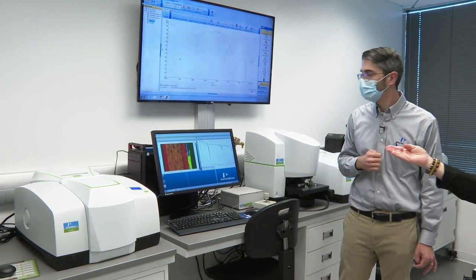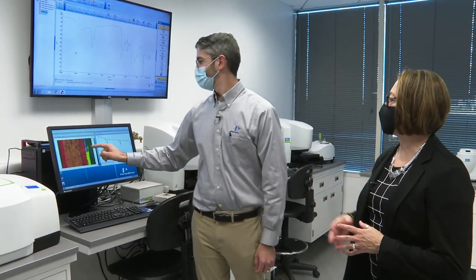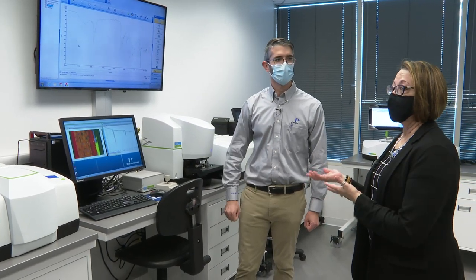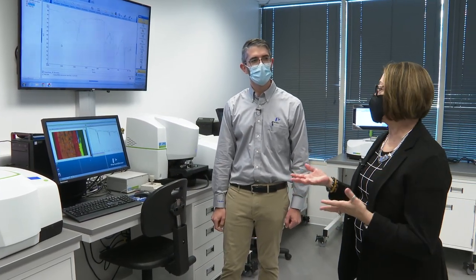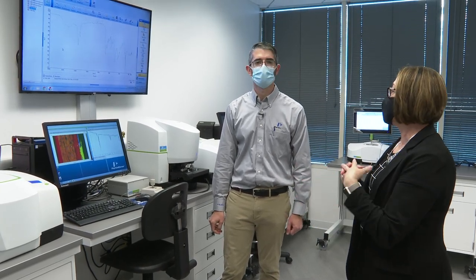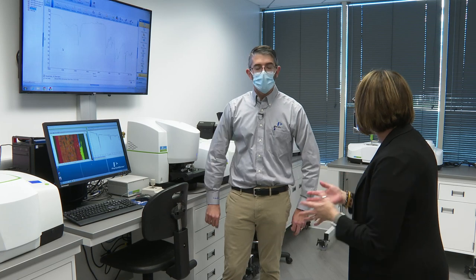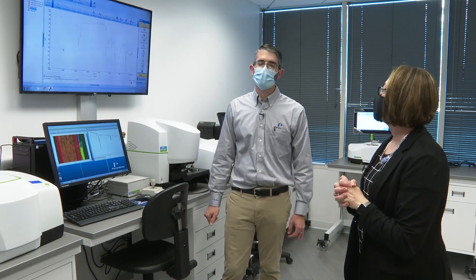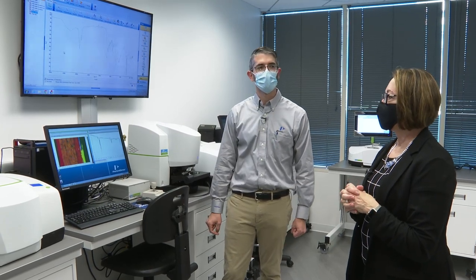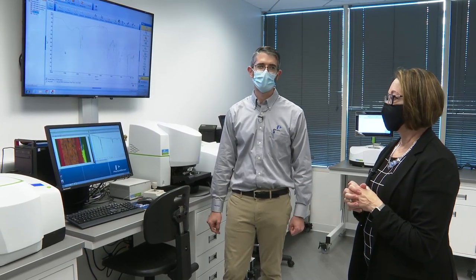How many layers in this particular image? Six layers. And as we've run many different packaging materials — ketchup bottles, plastic bottles — they can have 16 layers. Quite a few layers in many packages. Some of these are very unassuming products but when you perform infrared imaging on those samples it really brings out the details.